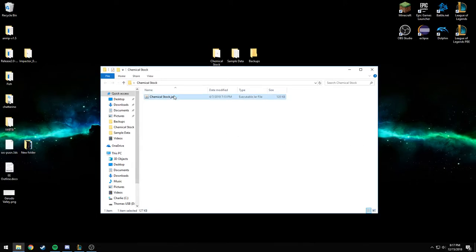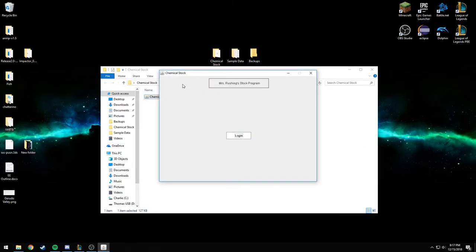Immediately upon opening the program, the user is met with a nice and simple GUI mainframe, which acts as the parent class for the entire program. Clicking on this JButton instantiates a login window that allows access only to the desired user.